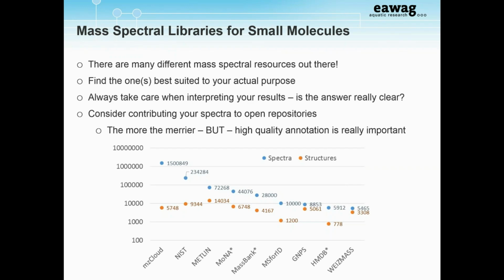So here's another question. I think that's more, it's both for GCMS and LCMS the case. So if you get a good database hit, is there a good way to satisfy yourself that some compound not in the library wouldn't fit just as well?